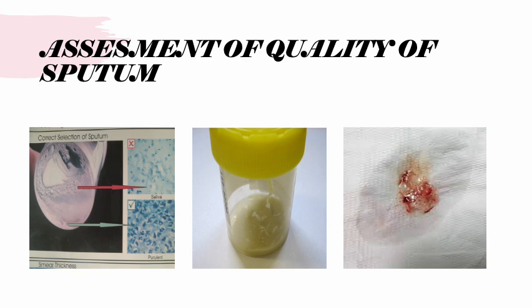This slide shows you the assessment of the quality of the sputum. Please take note of the leftmost portion of this slide. This type of sputum should be avoided: excessive saliva and inadequate amounts of mucous material, or sputum material. Usually we check the quality of this type of specimen by microscopy procedure. We count the cells, your epithelial cells against pus cells.